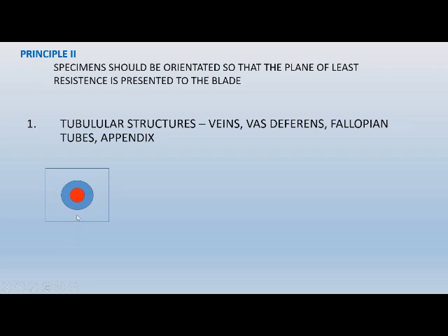And as we cut up through the block, we're starting out small, getting a little bit larger, and we're only spending a little time going through this entire width of the specimen. So irregardless of how we turn this block around, we're pretty much going to naturally go through this circular specimen, presenting the plane of least resistance and possibly getting the best section we can.